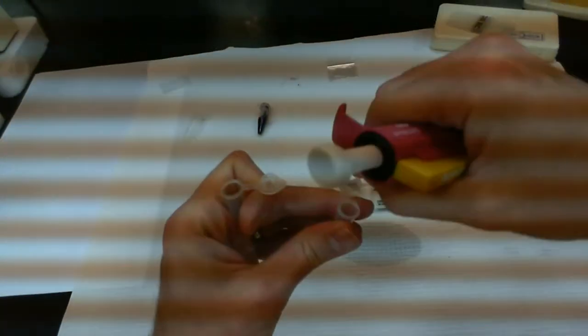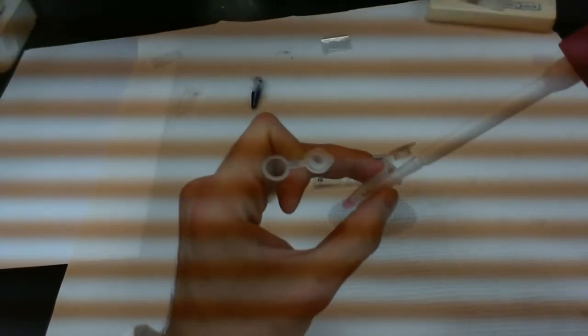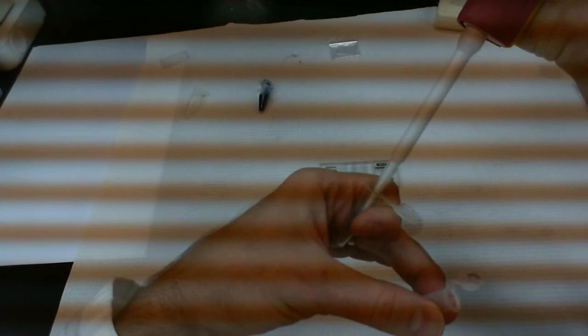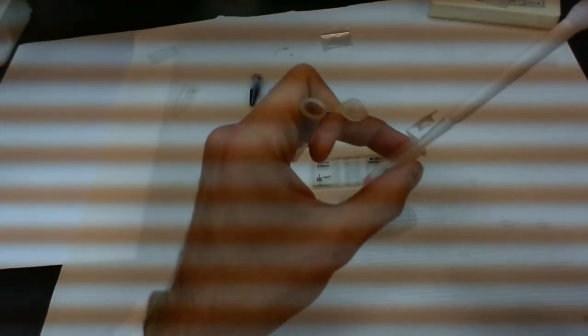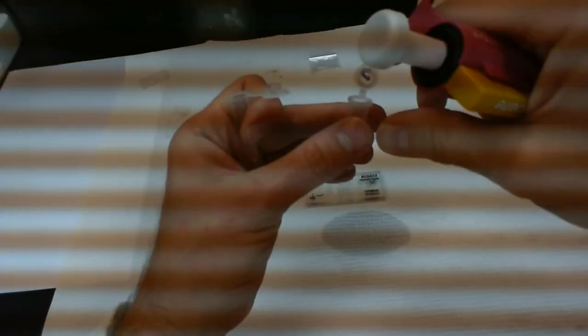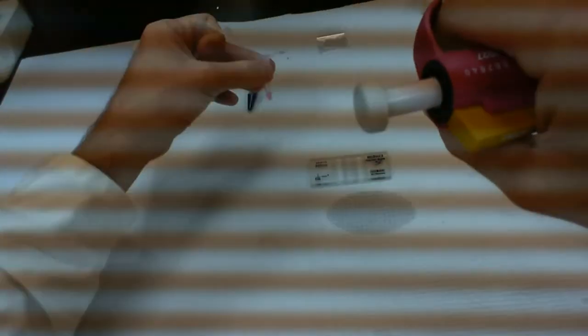Okay, so I'm going to take an epi tube, and I'm going to add 20 microliters of my cell culture. This is a P10, by the way, so I'm going to use it twice. I'm going to take my pipette up and down a little bit just to make sure, and apply it to my tube. Again, do it again. You want to make sure that your cells are well distributed so that you're taking a fair sample of what's inside this tube. Okay. So I have my cell sample in here, 20 microliters.